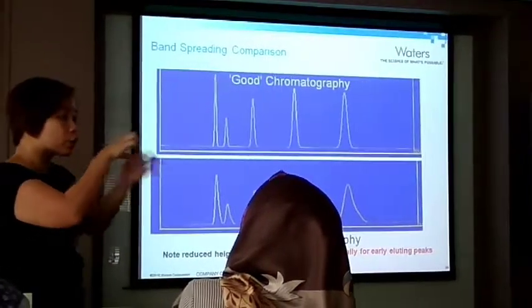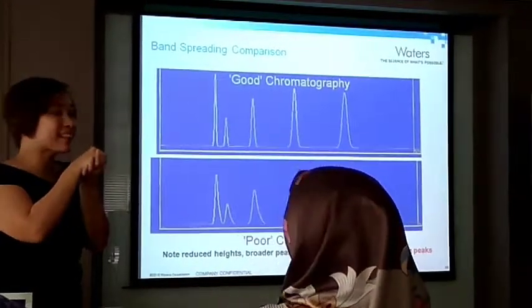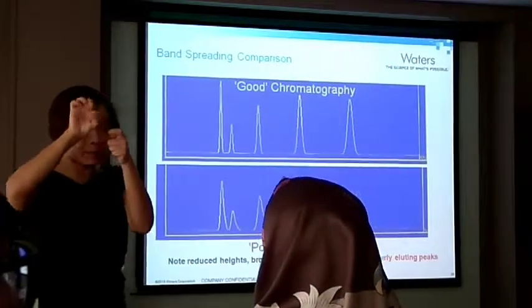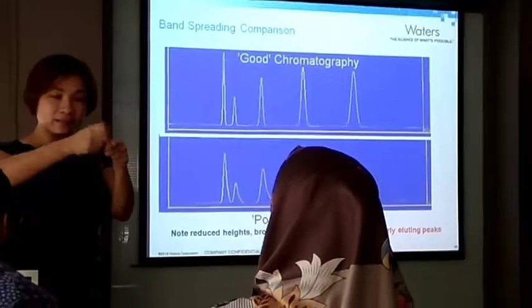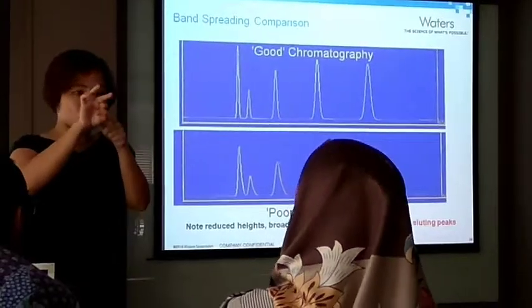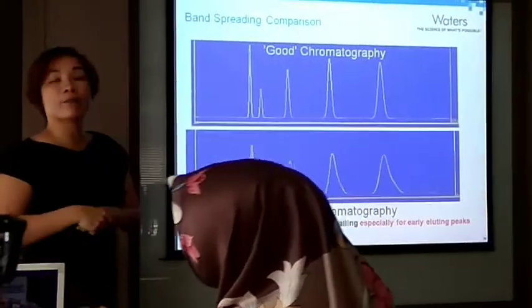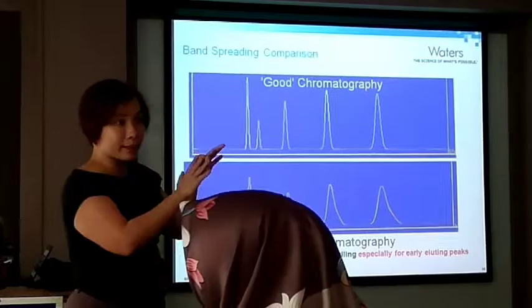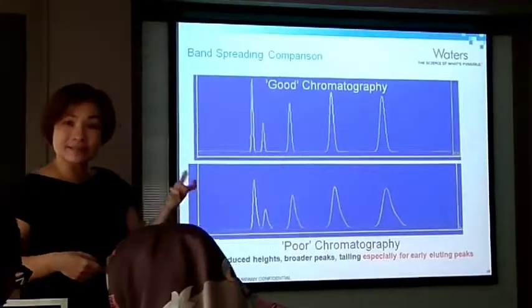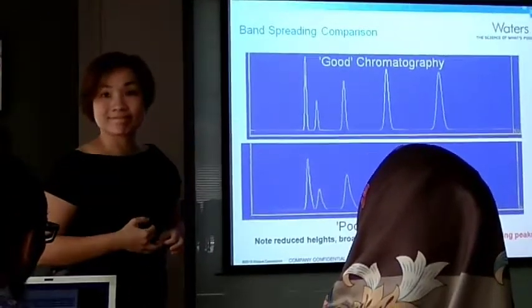That means it's forcefully constricted. You understand? That means the hole of the tubing has been constricted because of over tightening. And when you loosen and tighten too many times, sometimes it will start to have that constriction. And when you start to have that constriction, you will also have problems with your back pressure and separation. So you should always check your tubing. Once you see that it's constricted, once you see that there's a line there, either cut the tubing or change to a new tubing.